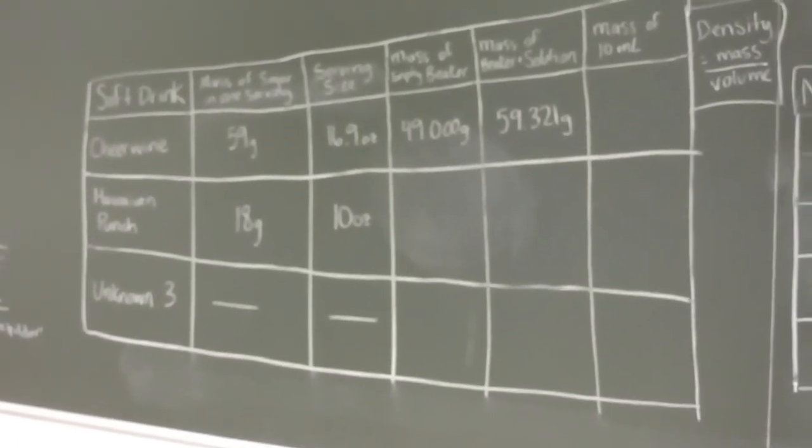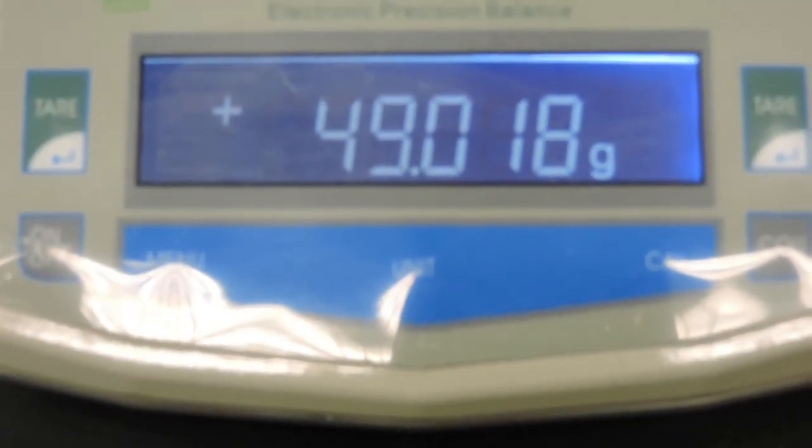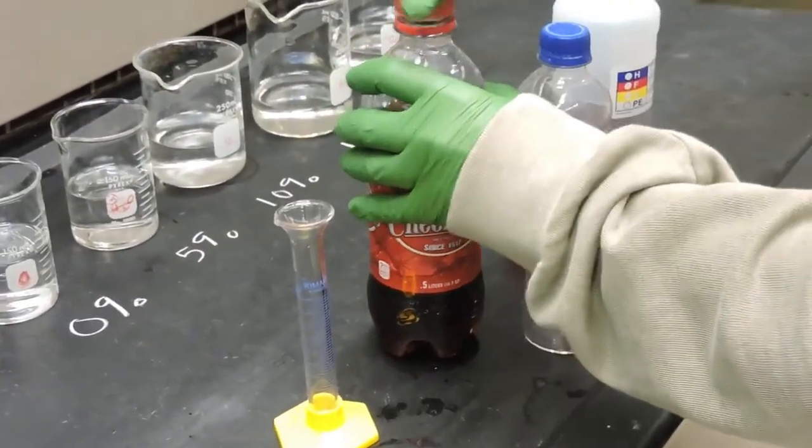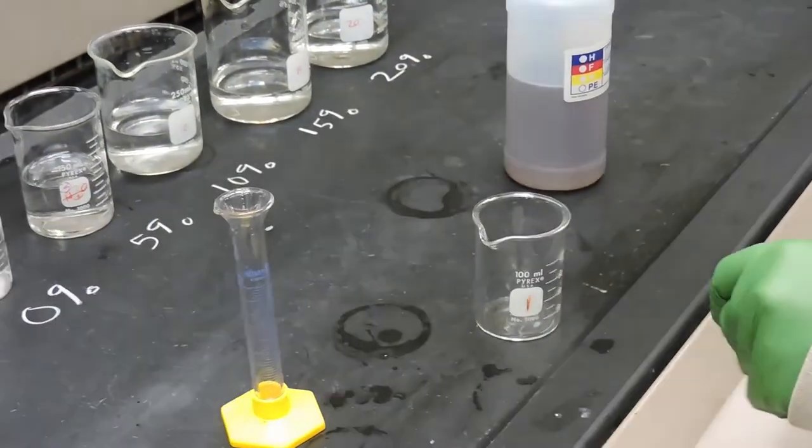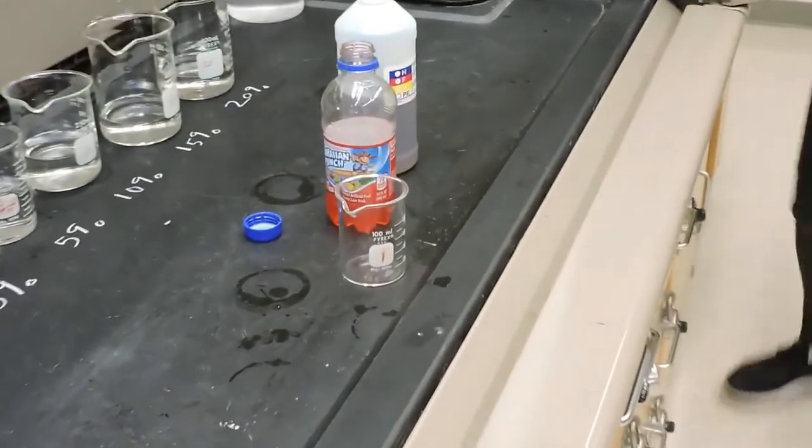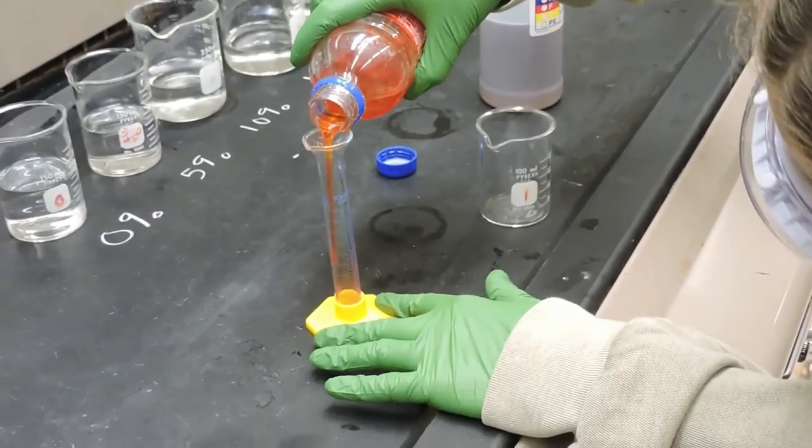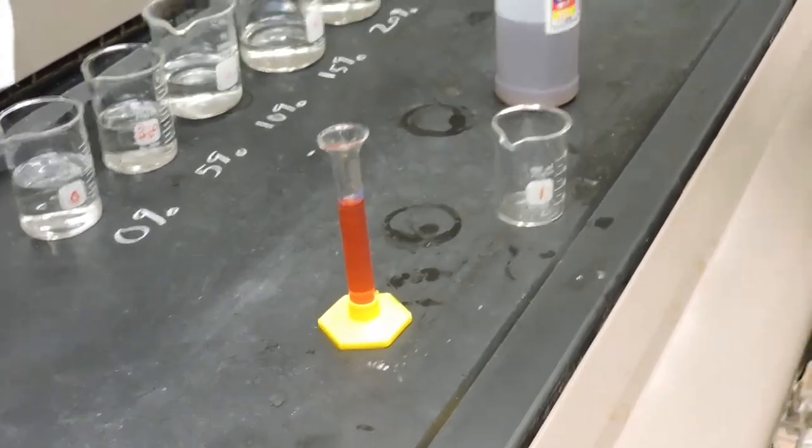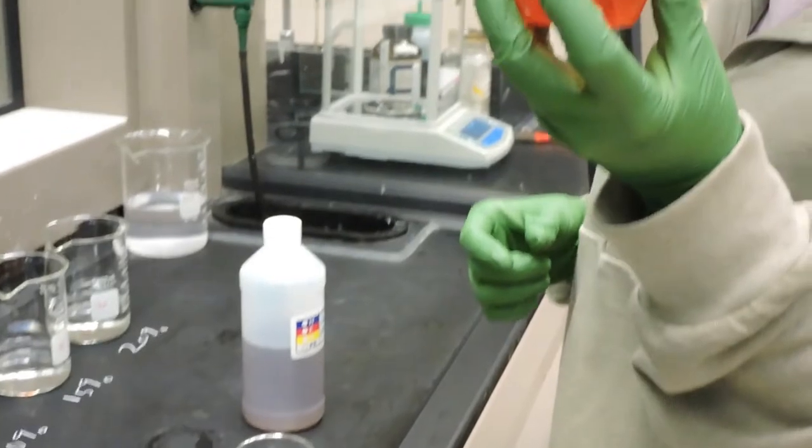Next, we'll find the Hawaiian Punch parameters. So first we're going to pre-weigh the beaker. The mass of the empty beaker is 49.018 grams. And into the beaker we will place 10 milliliters of Hawaiian Punch. What flavor Hawaiian Punch is this? Fruit Juicy Red.